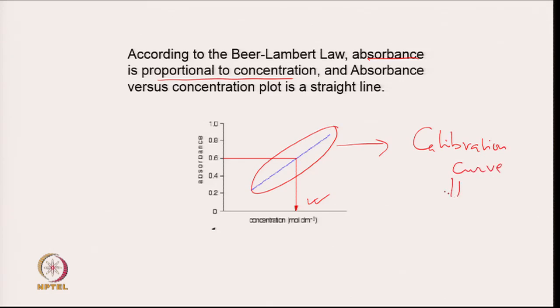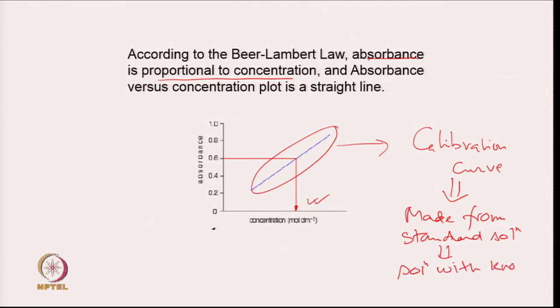and that is made from standard solutions. By standard solution, I mean solution with known concentration.